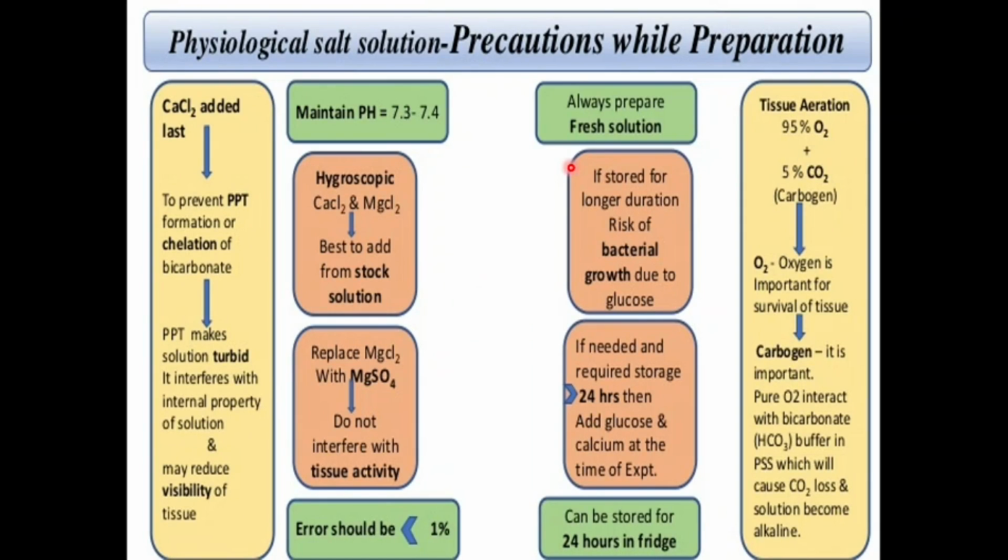Always prepare the fresh solution. The physiological salt solution should not be older than 24 hours, and it should be stored in the fridge at a temperature of 2 to 8 degrees centigrade. The reason is that you should not use the physiological salt solution which is older than 24 hours, because there is a chance of bacterial contamination, since you are adding glucose. Glucose is nutrition for the bacteria, so it is better not to use the salt solution which is older than 24 hours.